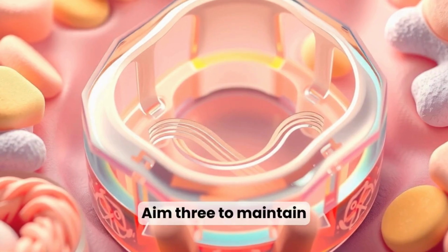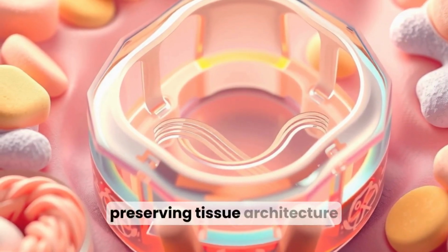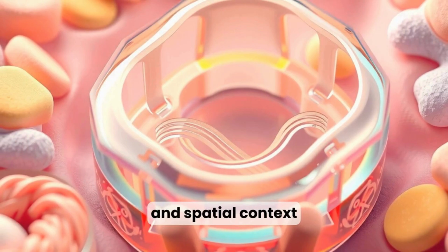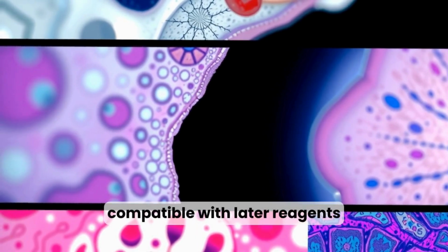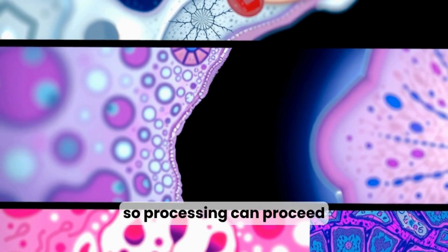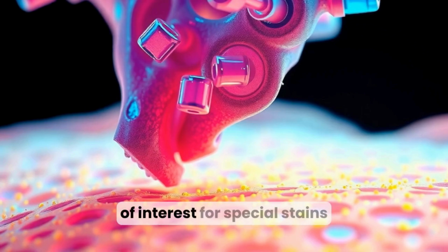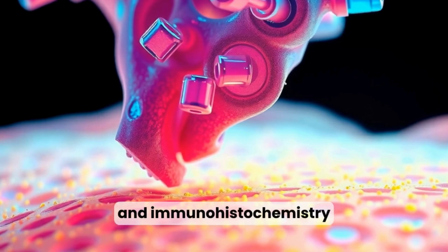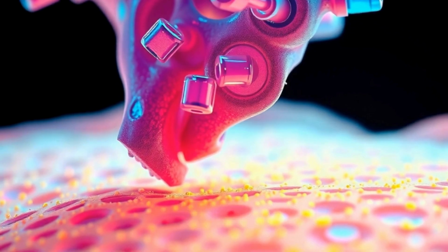Aim 3, to maintain relationships between cells and extracellular structures, preserving tissue architecture and spatial context. Aim 4, to render tissue compatible with later reagents, embedding media and sectioning so processing can proceed without artifact. Aim 5, to retain molecules of interest for special stains and immunohistochemistry whenever possible, while minimizing loss of antigenicity.